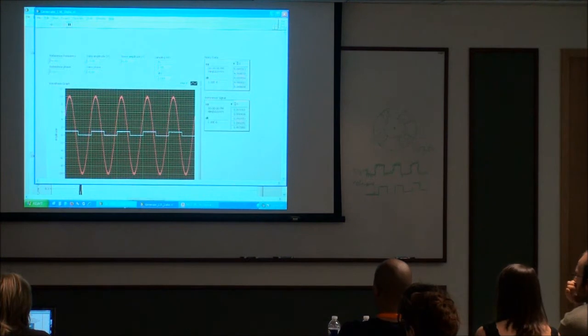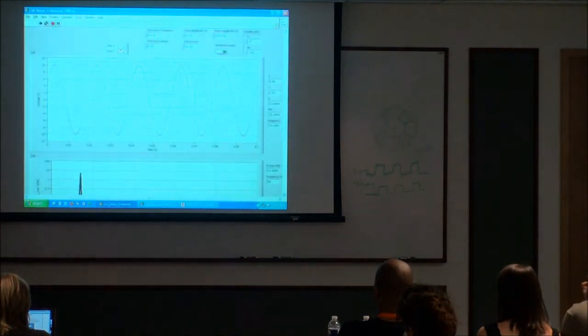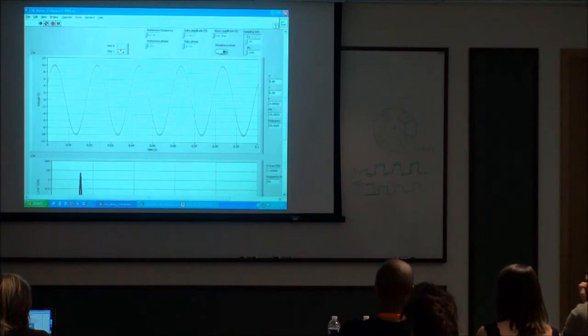So what that looks like in the demo is, I have this data signal, and I set my amplitude to be 10 volts. I generate my matching sinusoidal signals, and I can calculate these quantities x and y. This is the in-phase, and the other one is the quadrature component of this multiplication. And what I recover, this amplitude, is the square root of the sum of the squares of x and y. So this amplitude is basically agreeing with the amplitude that I set in, and the phase that I recover is the difference in phase between the data signal and the reference signal. So this is the initial demonstration where I have very little noise.